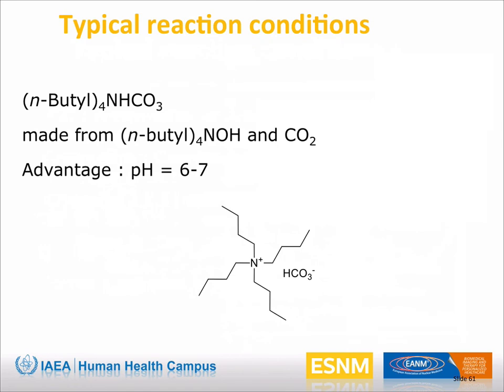As alternative phase transfer catalyst, tetrabutyl ammonium hydrogen carbonate is used. This positively charged cationic compound acts as counterion of fluorinating fluoride, while because of the four butyl groups, its apolar nature enables its easy dissolving properties in acetonitrile.